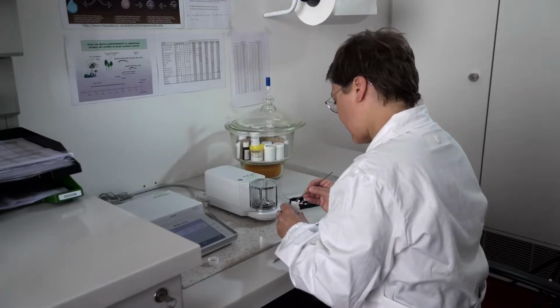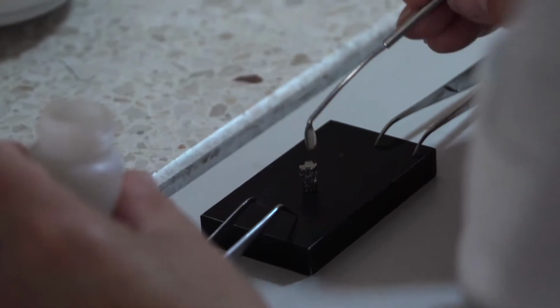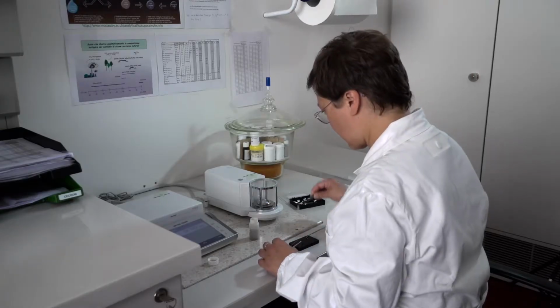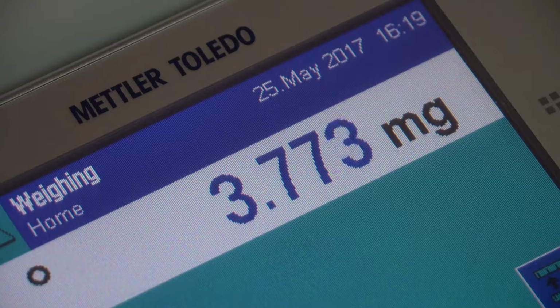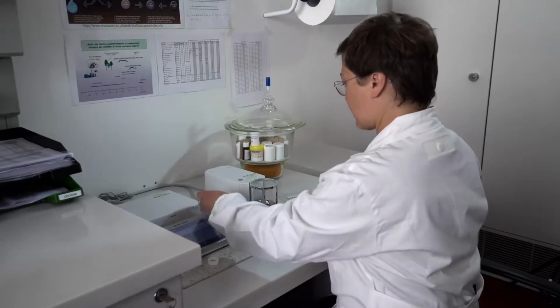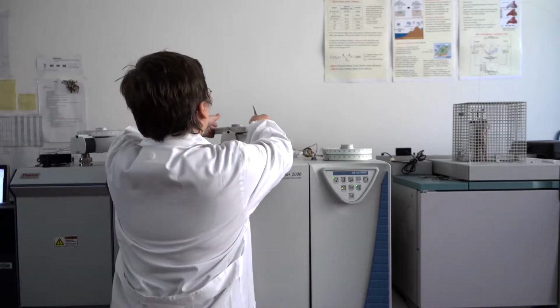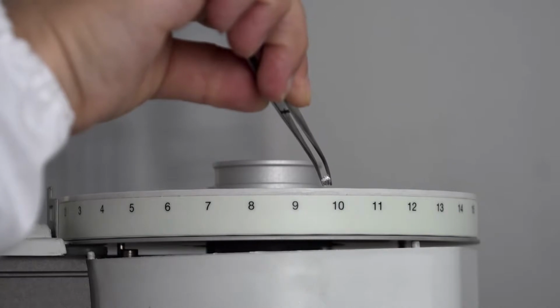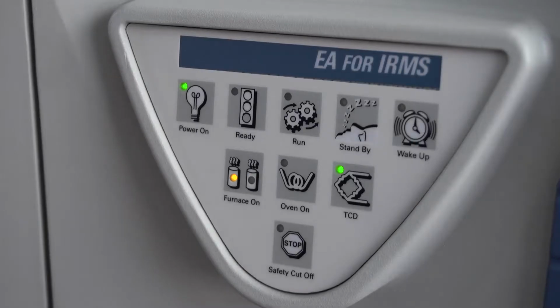In the lab at the Free University of Bolzano, the samples from Limburg are studied to determine their carbon content. For this purpose, the leaf is first ground, then weighed on precision scales, and finally burned at 950 degrees Celsius. During combustion, the carbon dioxide content is measured. The declared aim is to be able to determine the isotope ratio in apple trees accurately and in a scientifically comprehensible manner.